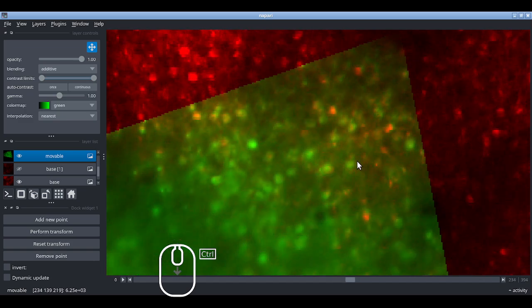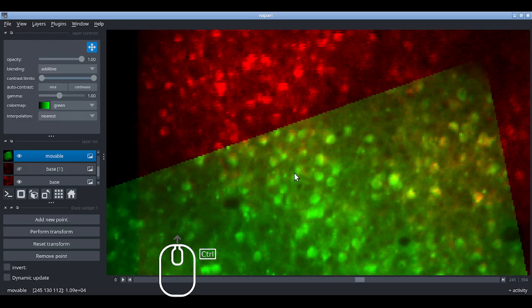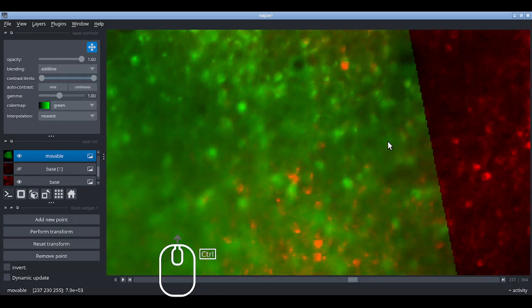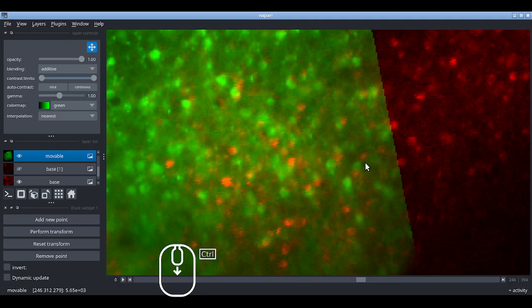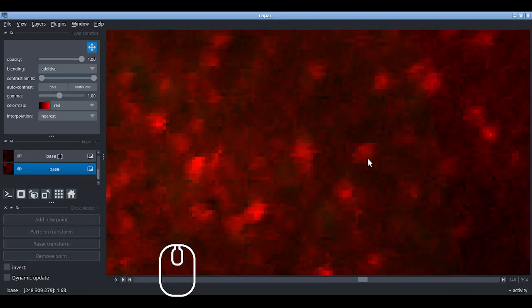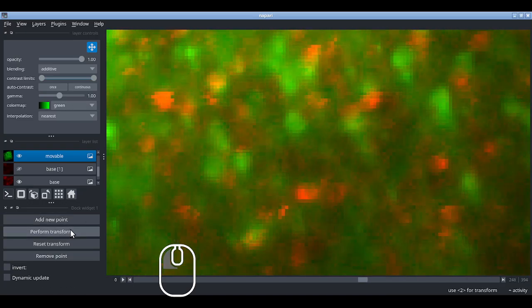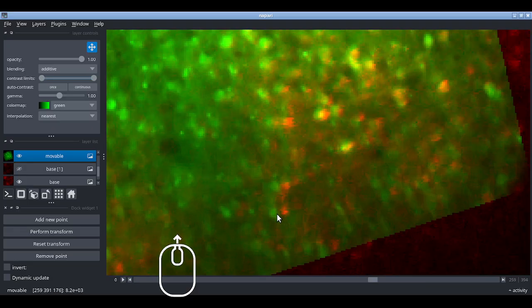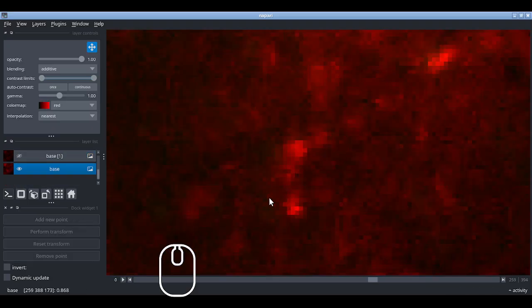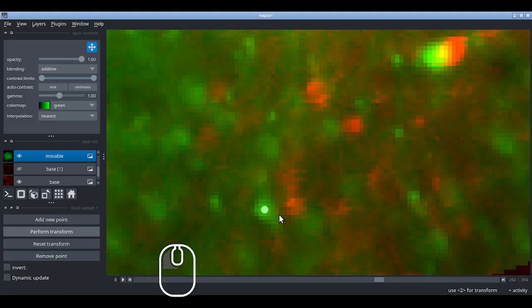And we can iteratively go through this and work our way out, because once we align a couple, it'll make it easier to align them a little bit further away. So now over here, this is a good one. That's a good pair. Let's just perform. Okay, so now we have a few more. And that makes it easier to see these. So this is a good one. This pair. Yep.